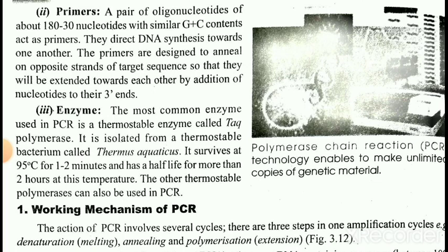3. Enzyme. The most common enzyme used in PCR is a thermostable enzyme called Taq polymerase.